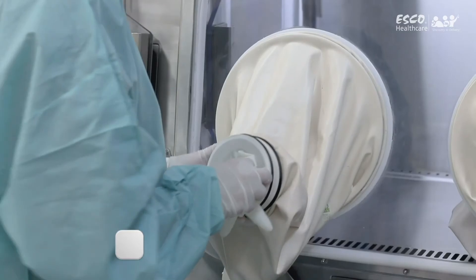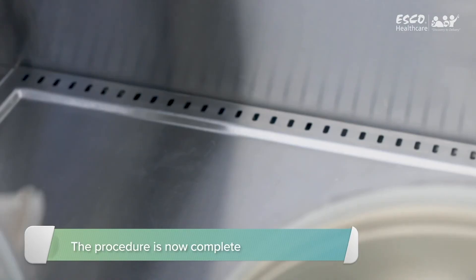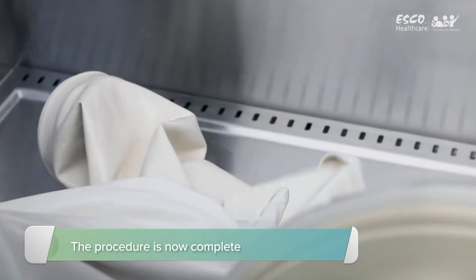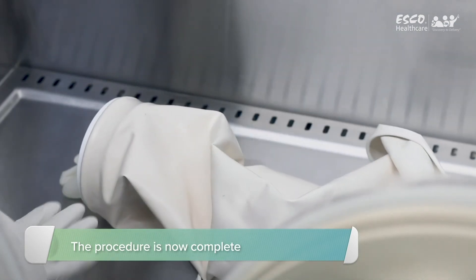Carefully work the old sleeve from the outer groove and into the isolator. Remove the old sleeve while under the new one. The procedure is now complete.